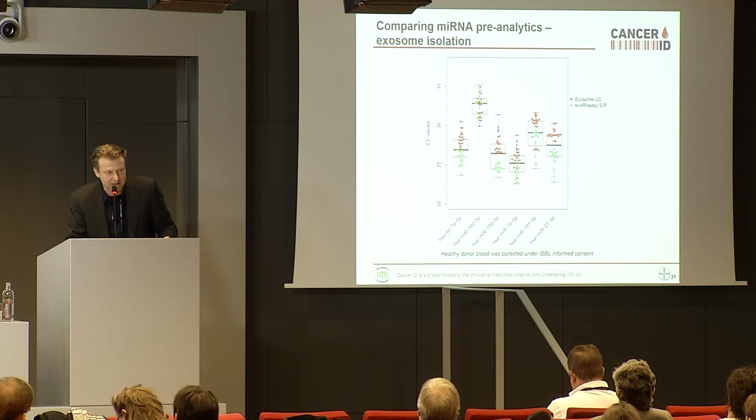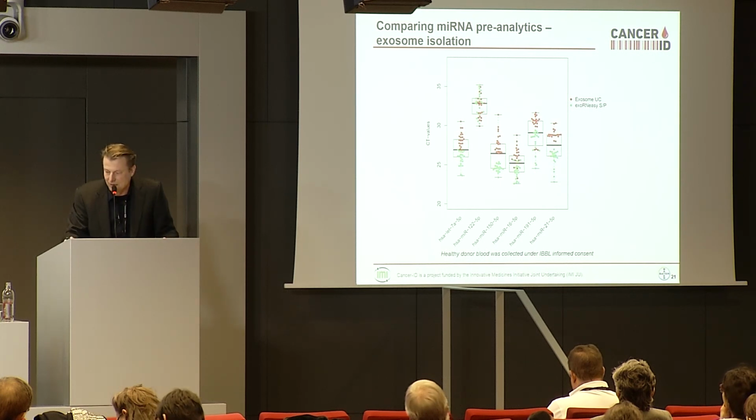And this, just to finish that up, gives you some typical examples. So here we compared a QIAGEN kit on exosome isolation, the ExoRNA Easy kit, with ultracentrifugation, which is, of course, a standard technology for exosome analysis as well. And we found that the ExoRNA Easy kit is a bit superior here. But there are some miRNAs as well where you get a mixed picture, so you may even have to look at that because it may have to do with the exosome localization of the miRNA in the end.